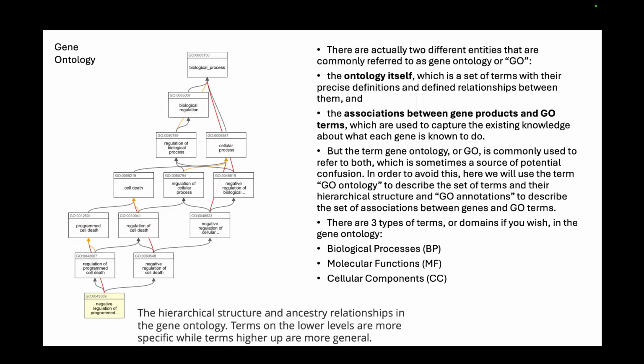Gene ontology analysis is used for getting an idea about the different types of factors, be it biological process, molecular function, or cellular component. What is a set of genes actually contributing to in a cellular system, be it location-wise, function-wise, or some other process-wise.